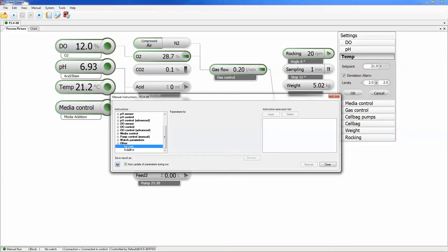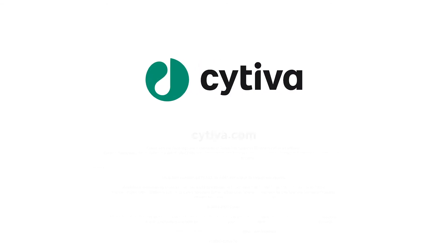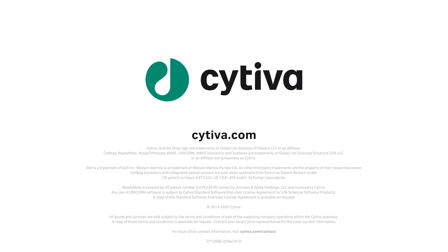Offline parameters and run notes can be added for trend reports.